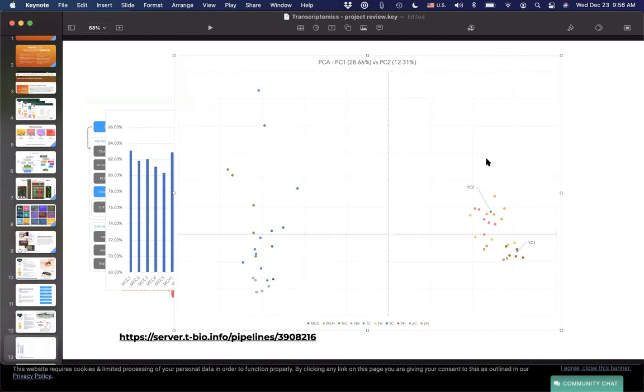But the first question would be, is there any level of expression difference between the different control groups, right? So if you forget about the heat shock for a second and you just take the control, like you mentioned, there is already some visible separation. What if you just do PCA of these and you also ask the question, what are the differentially expressed genes between this group that is inbred and the rest of them, biologically speaking, maybe mapping onto pathways or something like that.